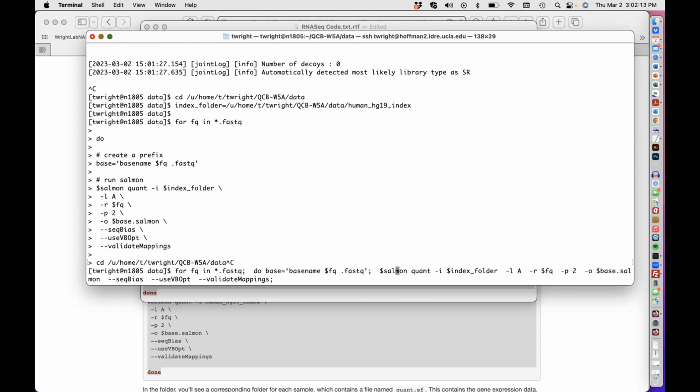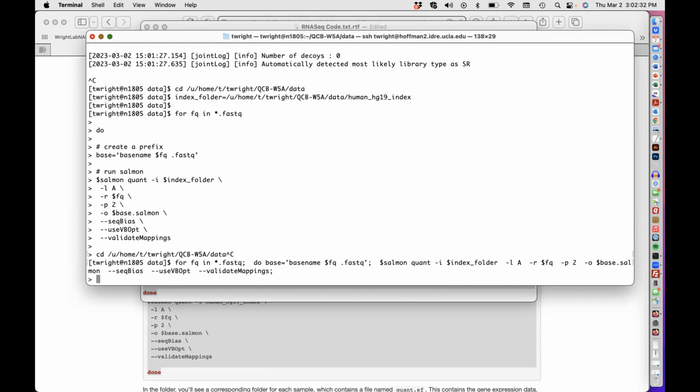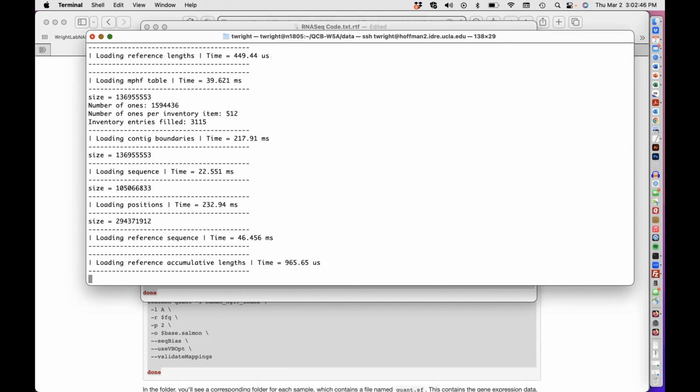Is it just this one here? It's both of them, I think. You just have to replace with that. Oh, there it is. Okay. And then I can just hit return. Yep, that should work. Oh, and then done. Yeah, that should be good. There we go.